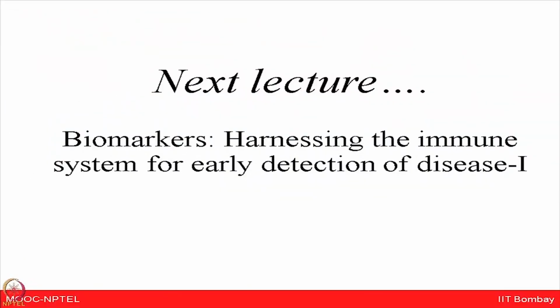I hope you got some understanding of this novel technology and a basics of some applications which could be performed using NAPPA arrays. Thank you very much.